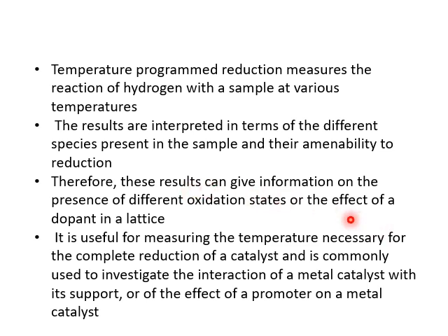And we can also study the effect of dopant in the lattice: by doping the material, the reduction ability is increased or decreased. We can study this effect. It is useful for measuring the temperature necessary for the complete reduction of a catalyst. We can measure at what temperature the catalyst will be completely reduced.